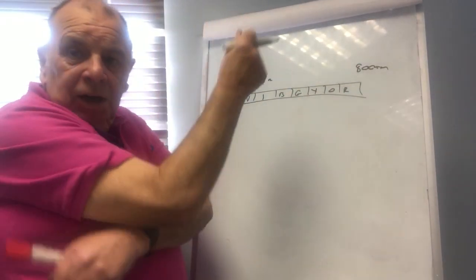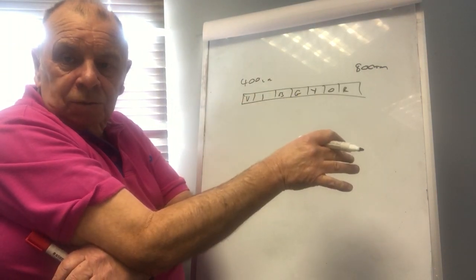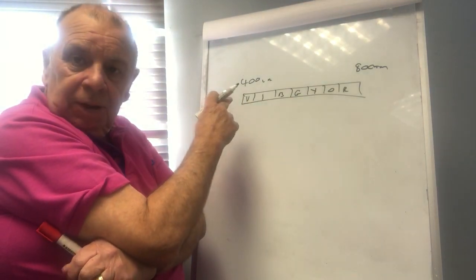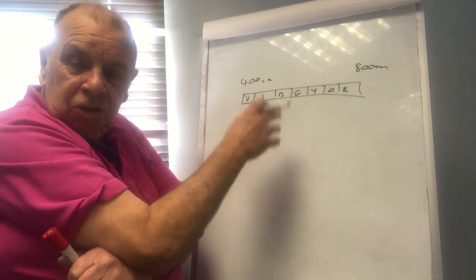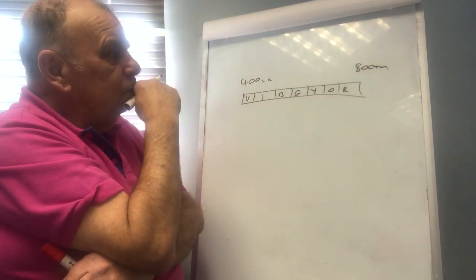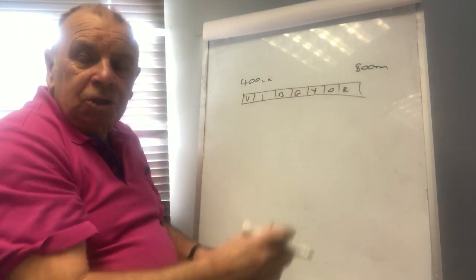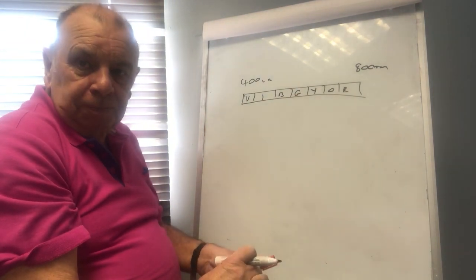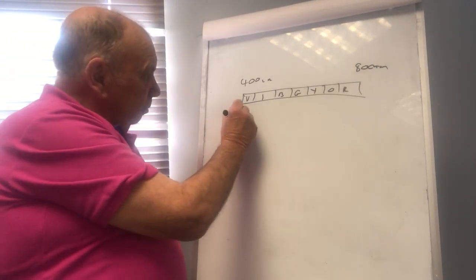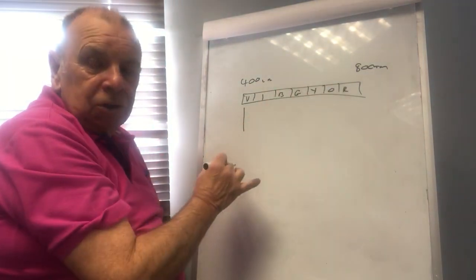So I've put those chemicals containing those cations into a photometer, a flame photometer, a flame spectroscope, and would you believe this, you get a spectrum or lines in the spectrum. For example, potassium would produce a line around that part of the spectrum.